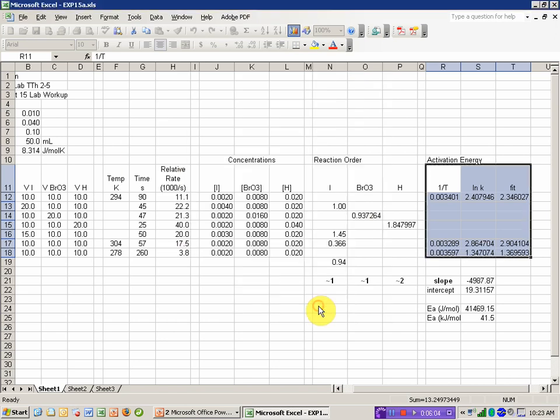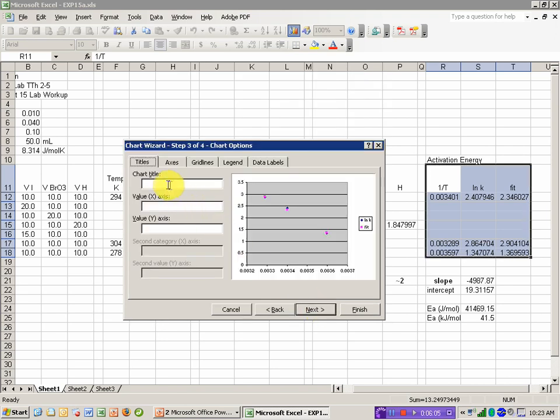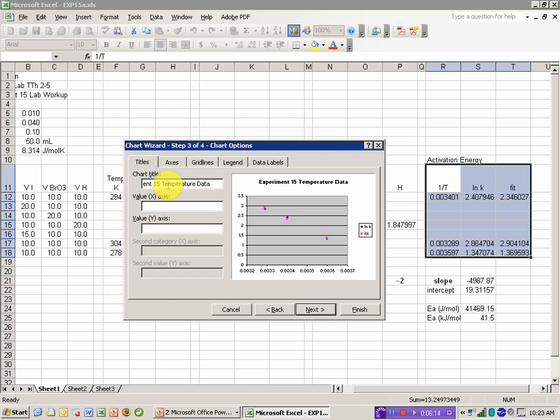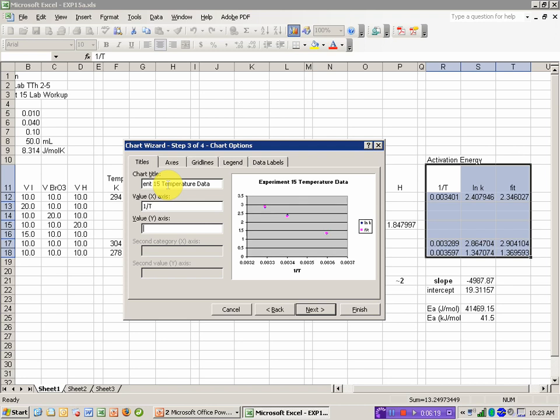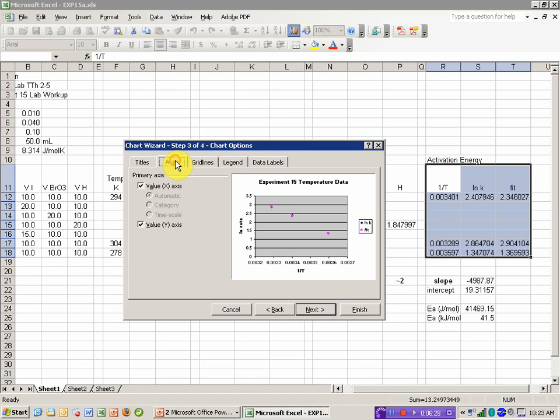It's going to give me a plot that looks reasonable. The slope is negative. My title is going to be, say, experiment 15 temperature data. The value of my x-axis, if you recall, was 1 over T. And the value of my y-axis was the natural log of the rate.